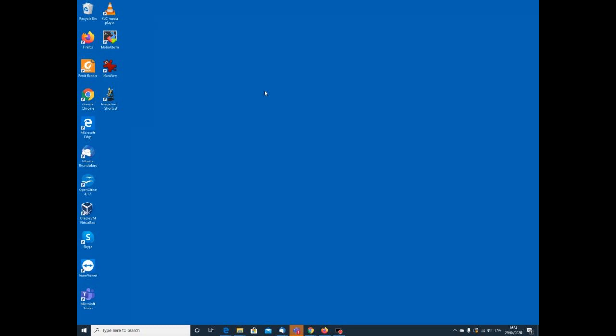So now we're going to use Fiji to open an image, add a scale bar and save. While we do that, we'll also have a look at some of the key functions that ImageJ has in the menu. So we'll double left click on the Fiji shortcut on our desktop, and then we get the Fiji menuing window open up at the top of the screen here.